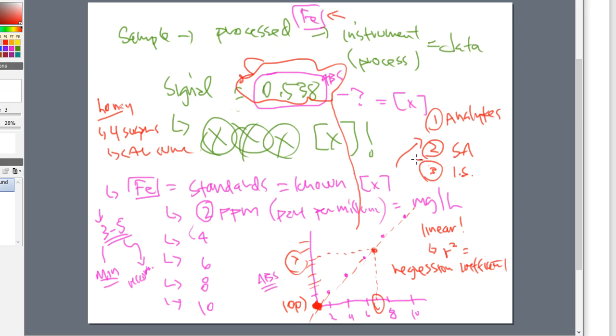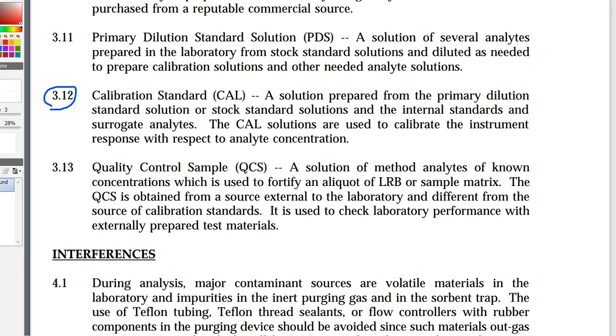Now, to be honest with you, a lot of times when we use internal standards in our lab experiments, I'm probably not going to make you use a calibration curve for those, and we're just going to look at signals from the equipment and the instrumentation. As long as the signals are staying constant throughout the samples and the standards and everything else, if we don't see too much variation, then I'm typically okay with that. Some people are, if they get that option, but others will have to build a calibration curve around the internal standards as well.